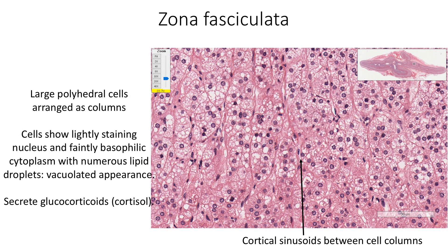Zona fasciculata shows large polyhedral cells arranged as longitudinal columns along the layer. These cells show lightly staining round nuclei; some may be binucleate. The cytoplasm is faintly basophilic containing smooth endoplasmic reticulum, mitochondria, rough endoplasmic reticulum, ribosomes, and numerous lipid droplets, giving a characteristic vacuolated appearance. These cells secrete glucocorticoids, mainly cortisol, under the influence of adrenocorticotrophic hormone from the anterior pituitary. Between the columns, we find cortical sinusoids lined by fenestrated endothelium.